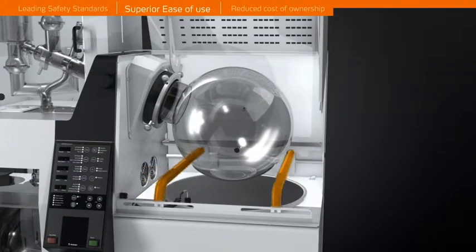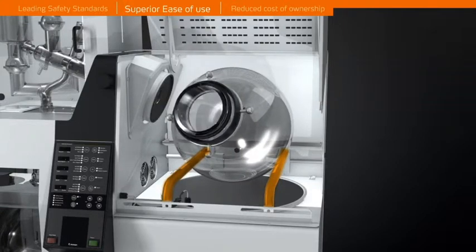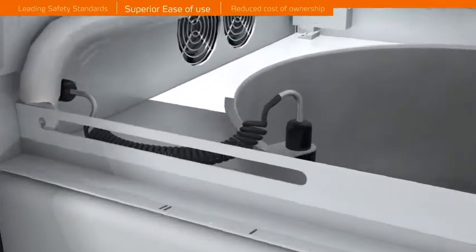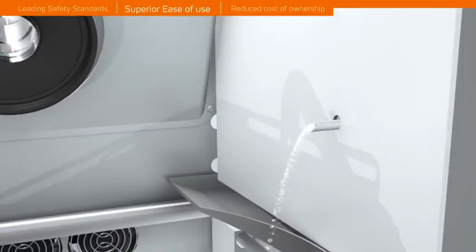The unique integrated evaporating flask support system allows for a true one-person operation, enabling the removal of the flask in just seconds. No hassle or safety concerns due to low fluid levels — the self-filling water bath takes the worry out of running dry.